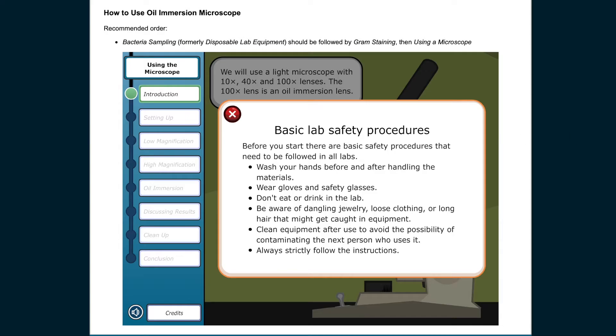Basic Lab Safety Procedures. Before you start, there are basic safety procedures that need to be followed in all labs. Wash your hands before and after handling the materials. Wear gloves and safety glasses. Don't eat or drink in the lab. Be aware of dangling jewelry, loose clothing, or long hair that might get caught in equipment. Clean equipment after use to avoid contaminating the next person who uses it. Always strictly follow the instructions.